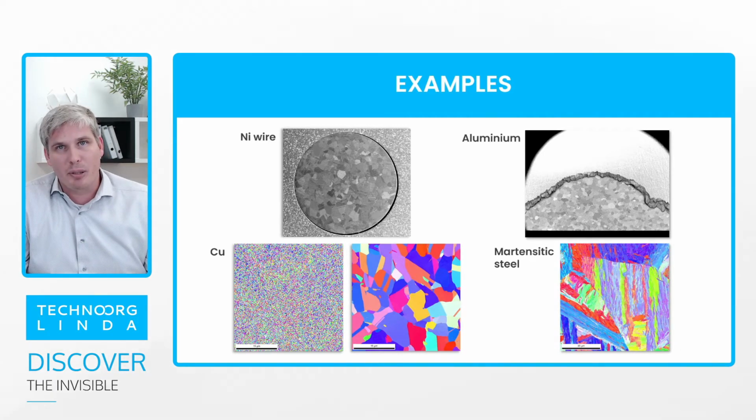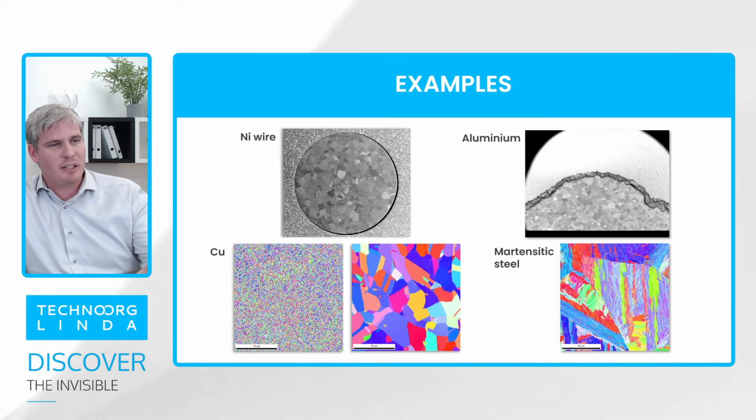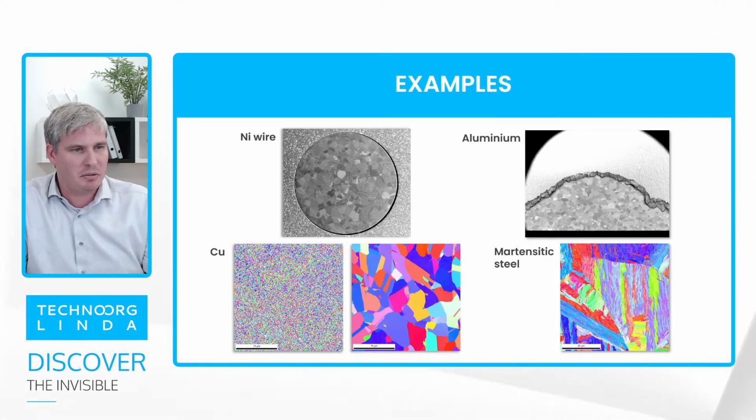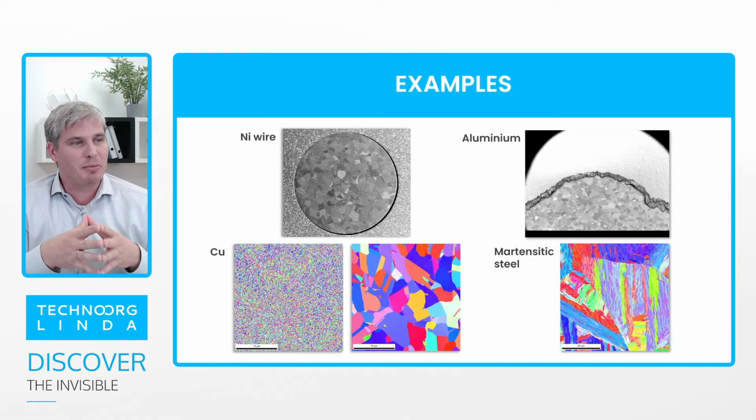Naturally, the preparation time is a little bit longer because these materials are a little bit harder to sputter, but this martensitic steel was prepared for maybe 45 or 50 minutes. So in less than an hour, you can have the ultimate result without any kind of problem. Basically, this is what you can achieve on SEM samples.